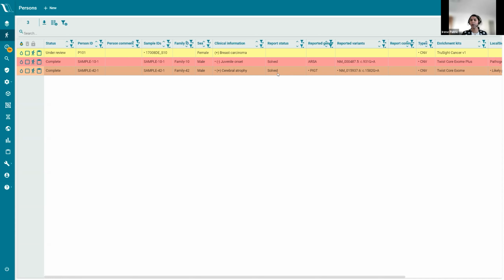But we are currently working on displaying this together in the SNV grid. When you have a compound heterozygous situation, soon we will also have the combination of CNV plus SNV in the grid itself. And soon means October. It's in the final testing phase, the end of October, and then this is available.